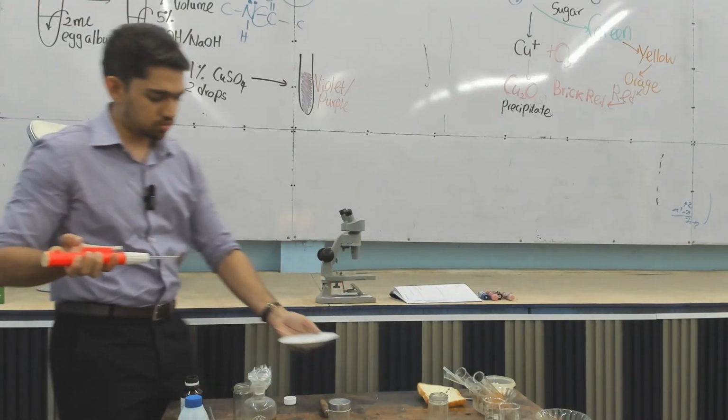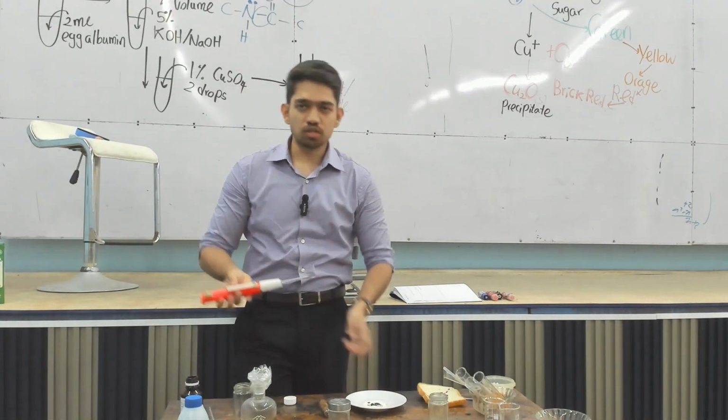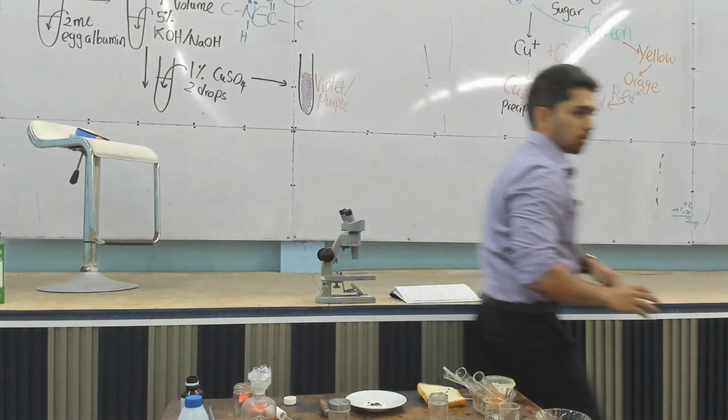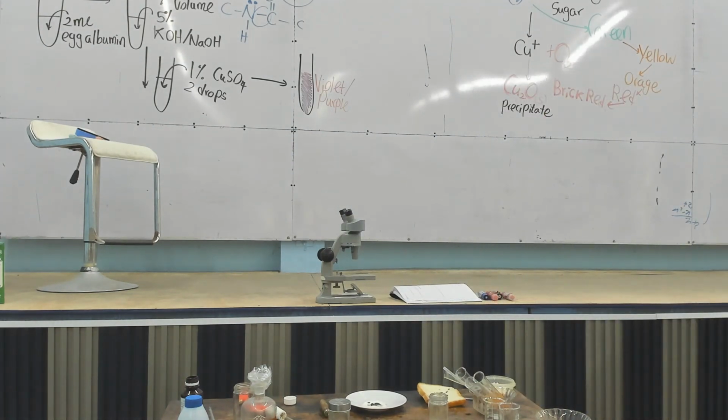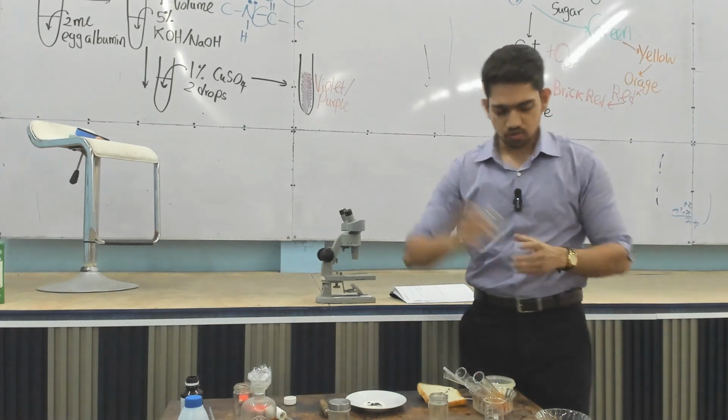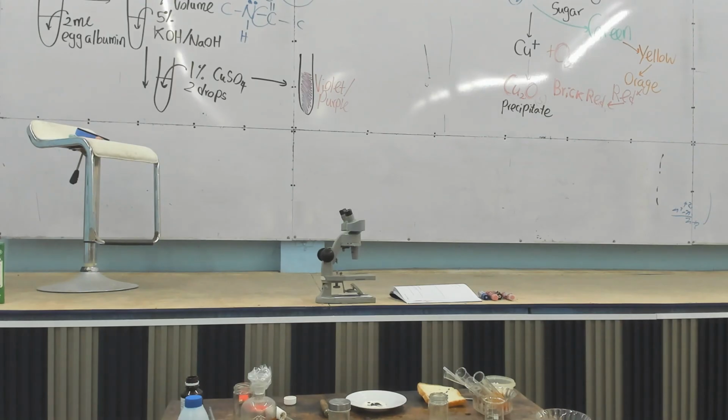What we can do is we can make a starch solution also, right? Shall we do it? I have a small one more. No, we'll make it to this, right? We'll make a small starch solution. Get a spoon somewhere. This spoon. Oh yeah.